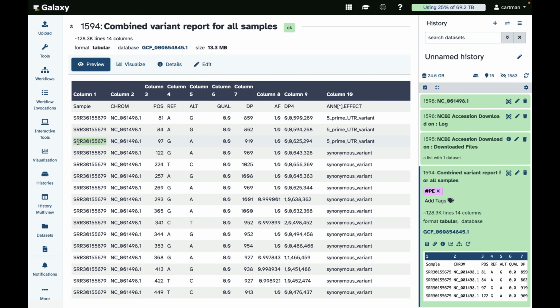Okay, the next thing is that let's look again at our variants. In this table, the only information about samples from which these variants are derived is this accession number. But we need more information. We need to know which country it's coming from, when it was collected, all that information. So we need not the sequences, but metadata about these samples. So let's get this data.